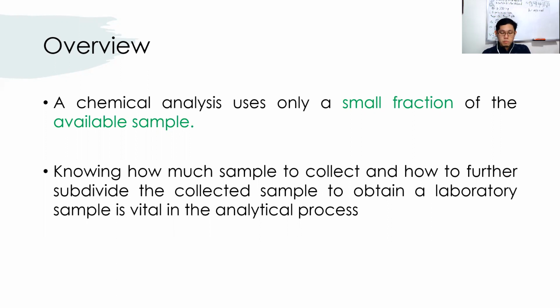So, para dito, pwede natin i-take for example yung collect environmental water sample. So, halimbawa sa river, marami ka na kasing makukuhang properties dito. Halimbawa is conductivity, pH, and turbidity.